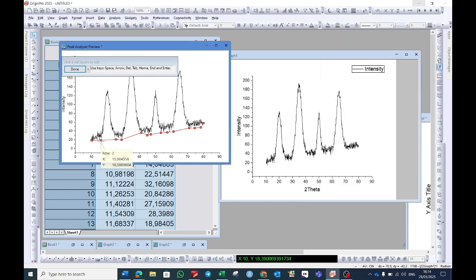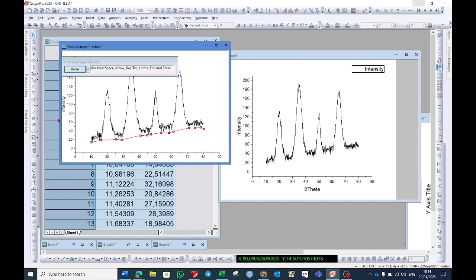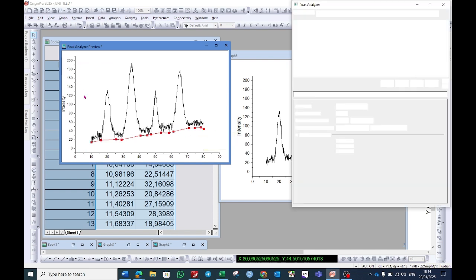For example, if I want to move this point below, just select this point and drag it down. The point will move down. Similarly is the case for the next. I will correct the data points. Once you are satisfied, select done.